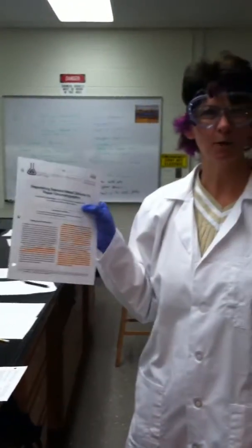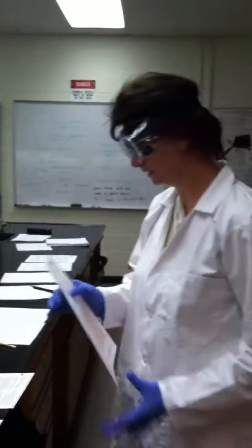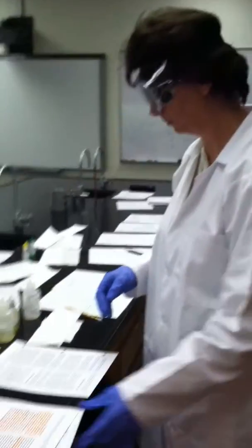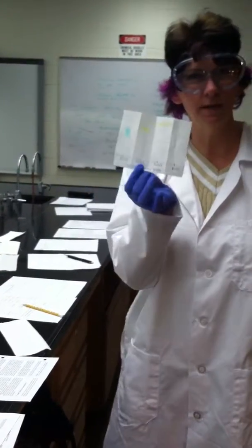We're in selected metal cations by paper chromatography, and we're at stage one of two spot tests for metal grain number one, which is right here.